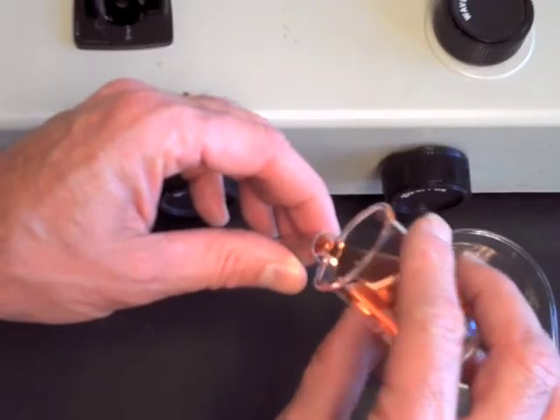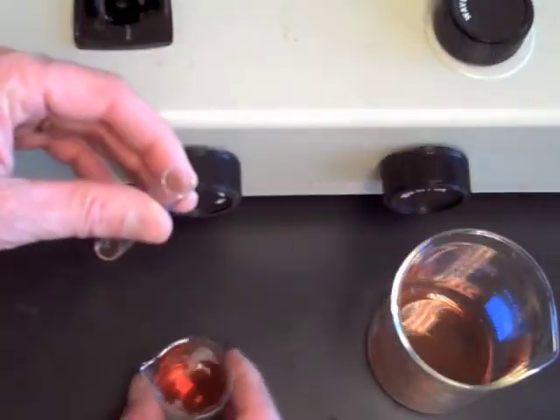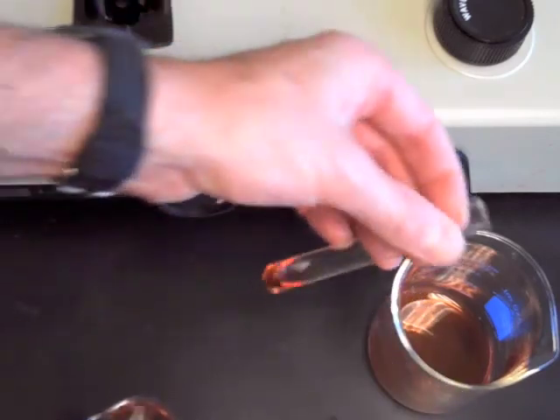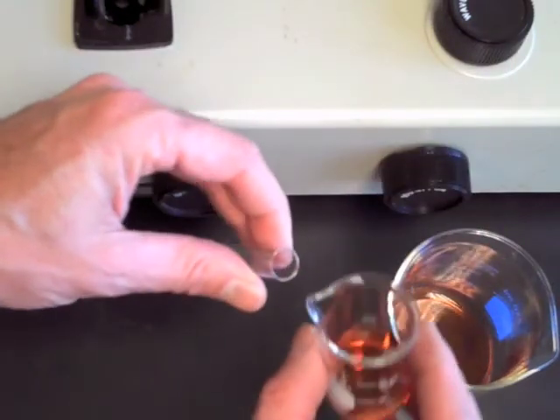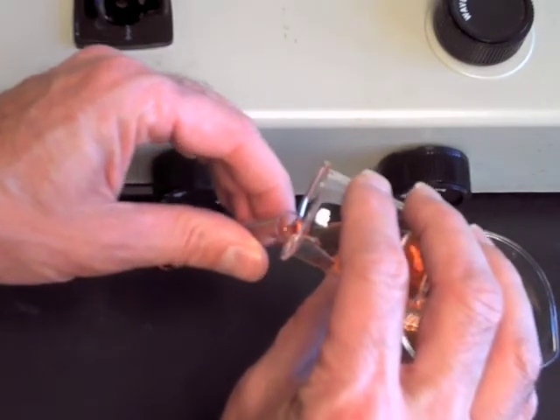When moving to the next test solution or standard, merely pour out the last solution and rinse the cuvette three times with small portions of the solution about to be tested. You do not need to wash out the cuvette any further, nor do you need to dry it before introducing the next solution.